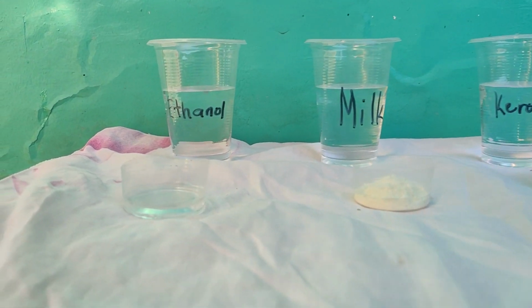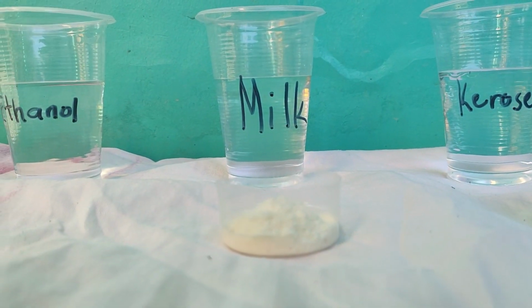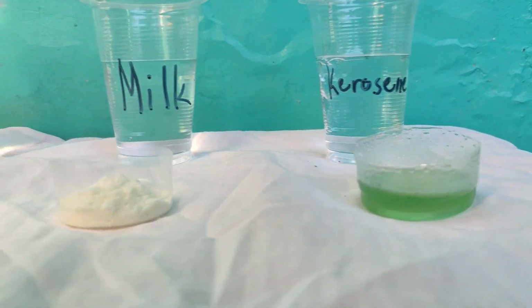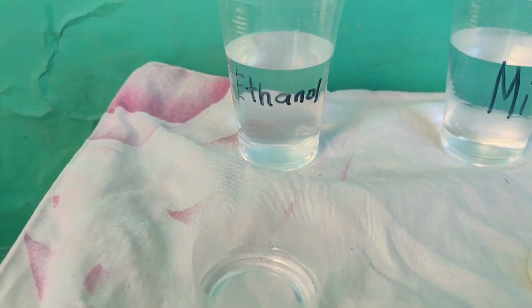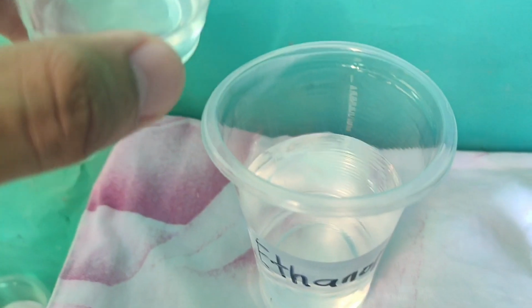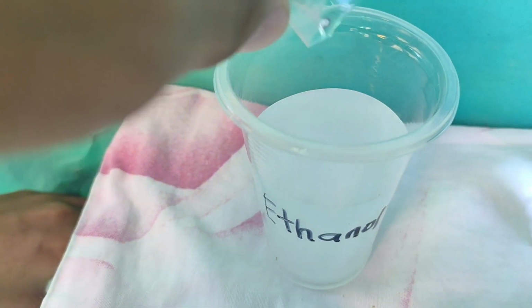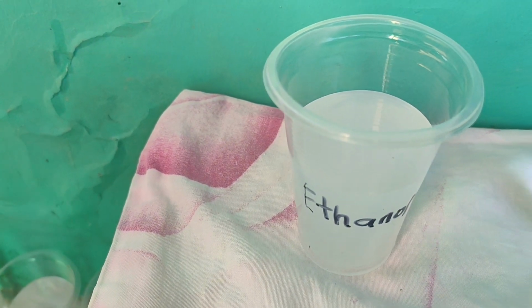So we have here the ethanol, milk, and kerosene. Here we put 1 tablespoon of ethanol, and as we can see here, the water changes its color and it's more foggy.